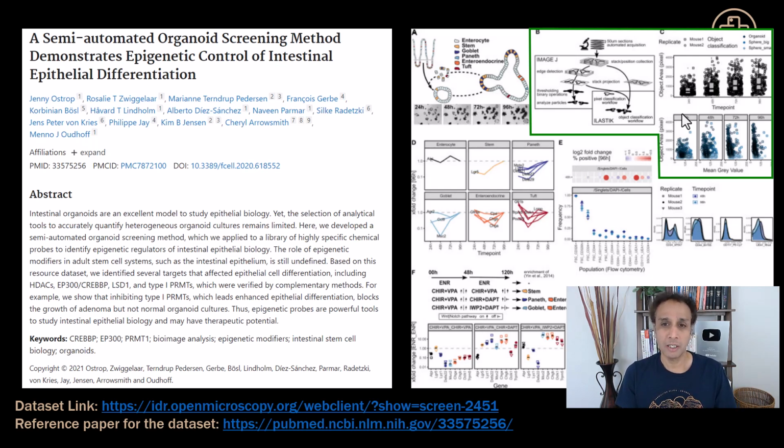But in this case, these are bright field images, and as you can see, right from this image, these are all against a bright background. You see some somewhat darkish objects. These are the organoids. So the goal for this exercise is, for each well, again, these are time series. In the data set we're going to use, there are 5 time points.